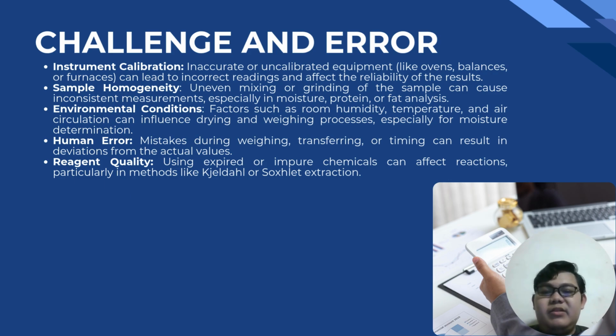Moving on, we have the environmental condition, which includes factors such as room humidity, temperature, and air circulation that can influence drying and weighing processes, especially for moisture determination.